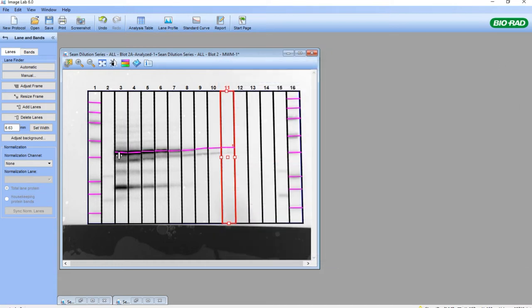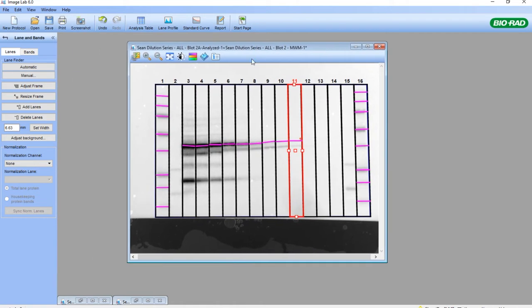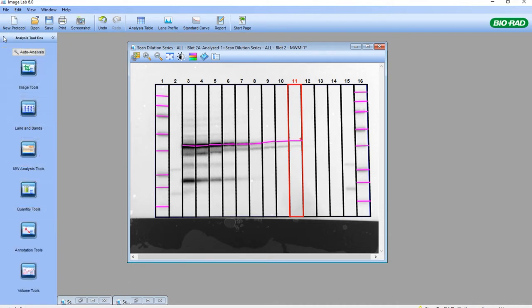These pink bands that we see are all right in the middle of the chemiluminescent bands or right in the middle of the marker bands. So now we're ready to perform molecular weight analysis. We click on the Toolbox and go to the molecular weight analysis tool.